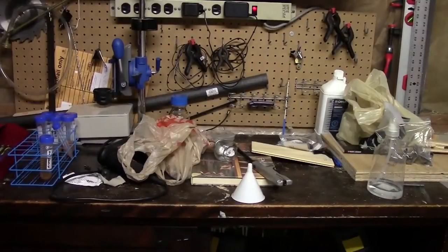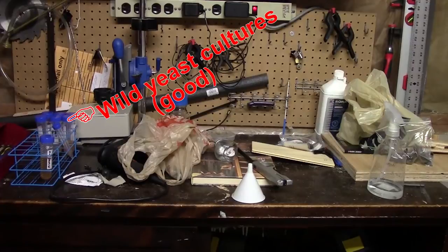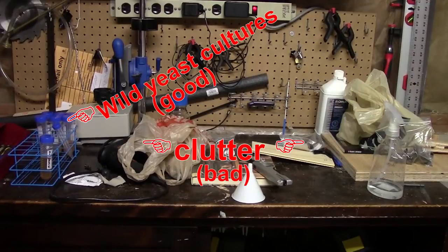So the most important part of having a home yeast lab is actually having a clean place to work. And it doesn't matter if you're trying to culture yeast or if you're just making starters — you need a clean place to work. So this is a good example of what you don't want: it's cluttered, it's dusty, it's dirty.